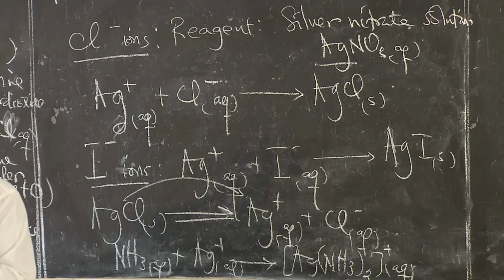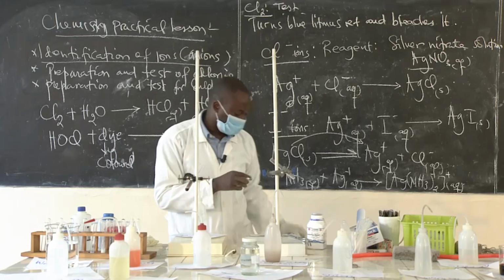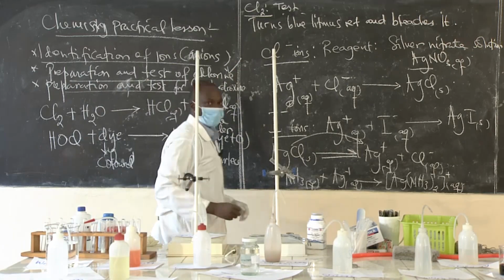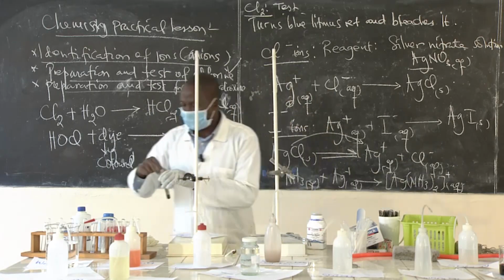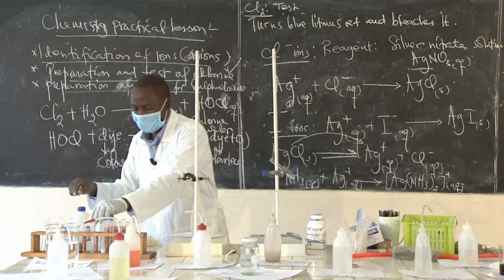So we can look at the test. Remember what I mentioned, that we are done with this. So we are going to look at this one, the sulfur dioxide as well. So the sulfur dioxide, there are a number of tests that we'll have to carry out.